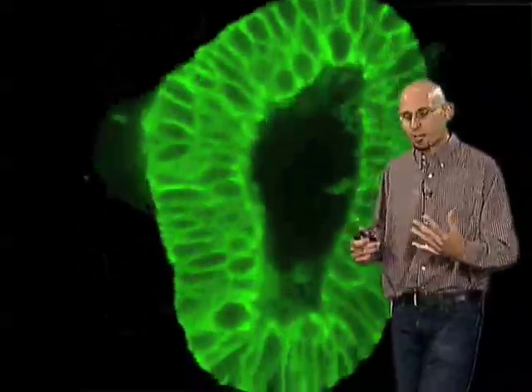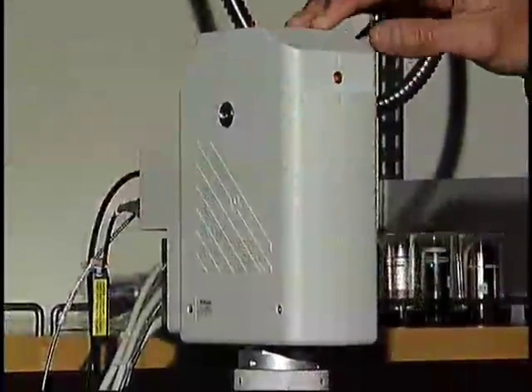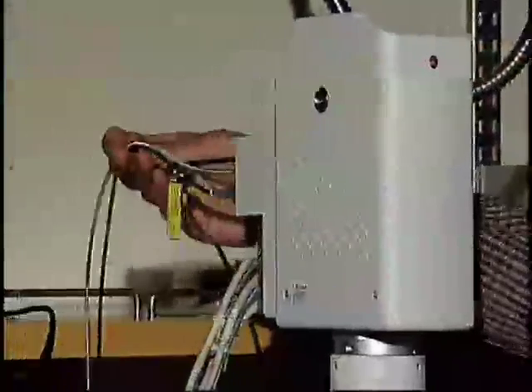So now let's go into the lab and I'll show you how this actually works in practice on one of the confocal microscopes in the Nikon Imaging Center. This is the Nikon C1 confocal in the Nikon Imaging Center here at UCSF. And what we have here is the confocal scan head. That's this box on the top of the microscope. This has the scanning optics that move the laser beam around the sample, as well as the pinhole that cuts out the out of focus light. And then it's got fibers that launch it to detectors and also coupling the lasers here.